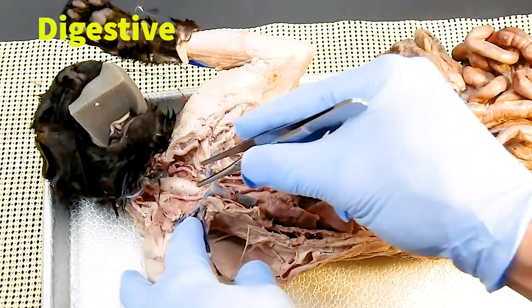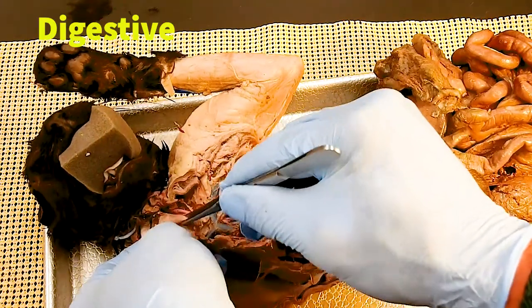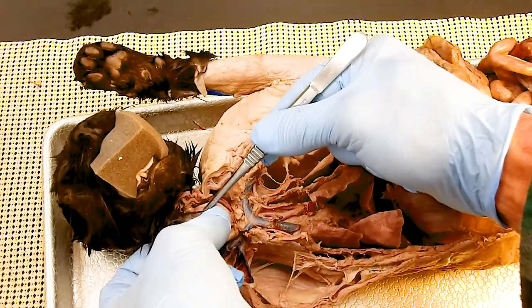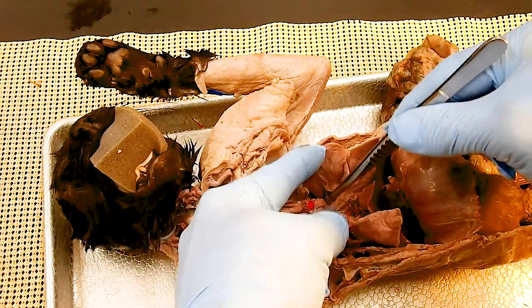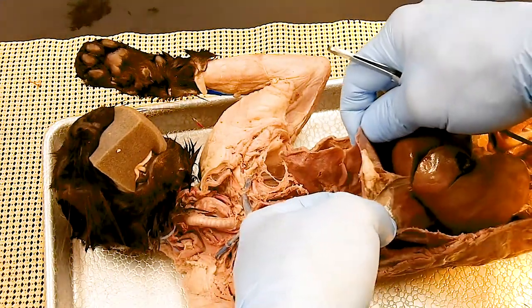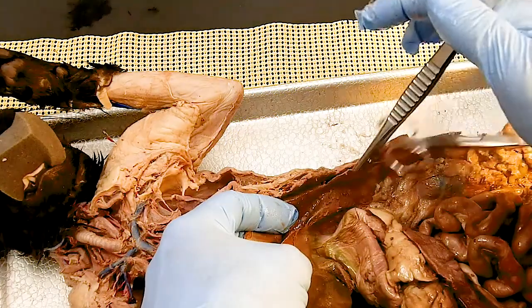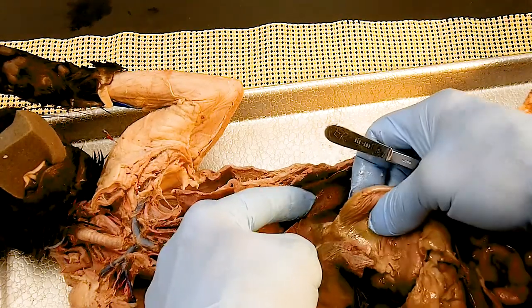All right, so we looked at the respiratory system already. There's your trachea there. Behind it, you will see a little muscular tube. Can you see it right there? That is the esophagus. It basically runs from the pharynx down. It's behind the trachea, goes behind the heart, which would have been here, through the diaphragm, right here, and leads into, here's your stomach, so the esophagus is right here.